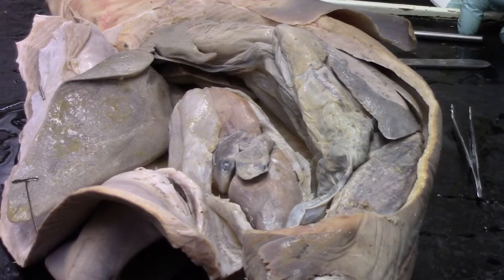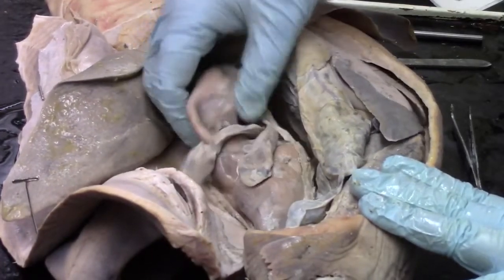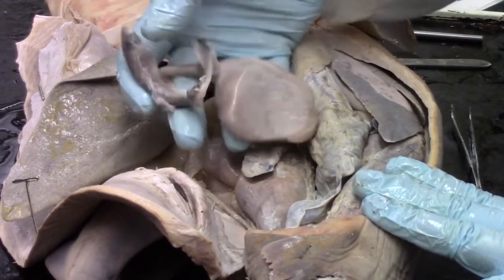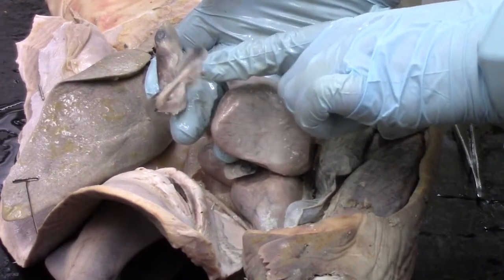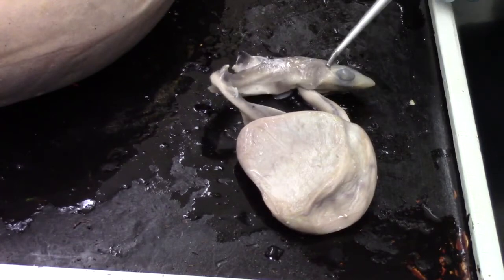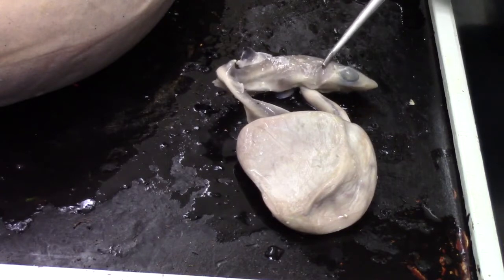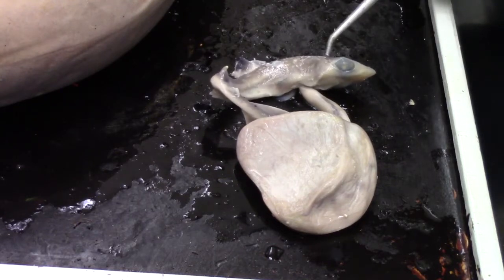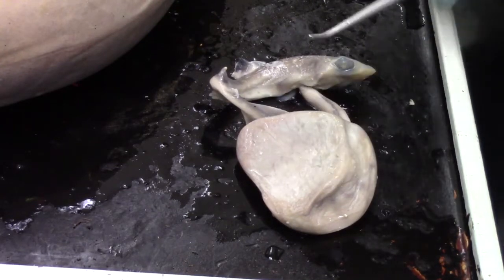I'm just going to bring them out so that we can look at them on their own. So I'll start from the top here. You can see that each of these has a yolk sac, and then they've got the developing embryo that's attached to that yolk sac. So here we have our developing dogfish embryo. You can see a lot of its external features are already quite fully developed. We can actually even see a spiracle right there. And these little developing embryos are then attached to the yolk sac.